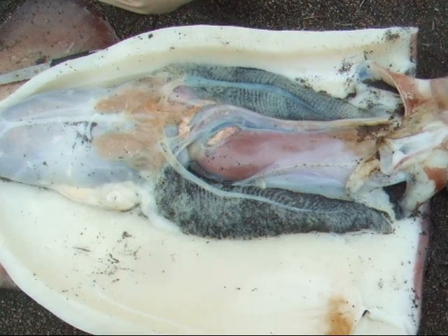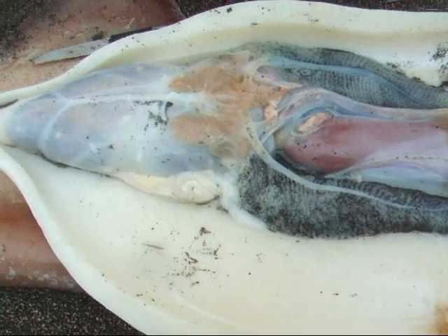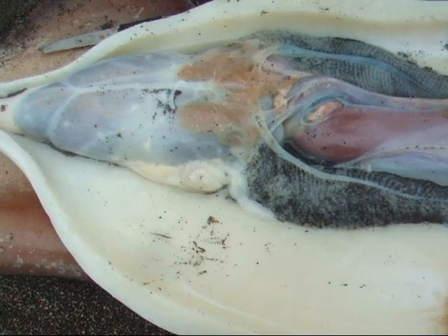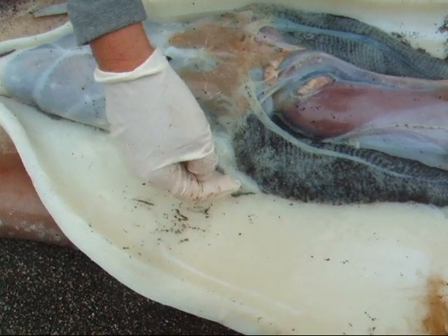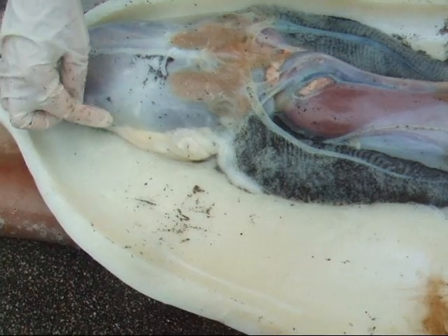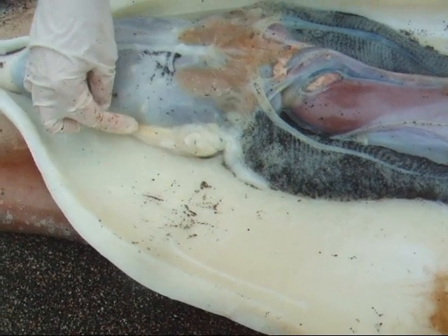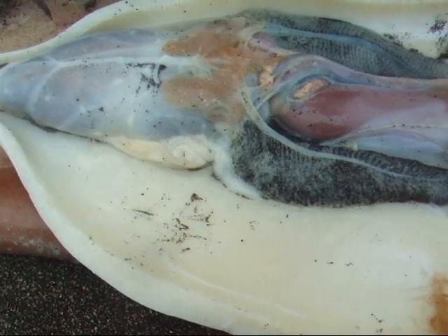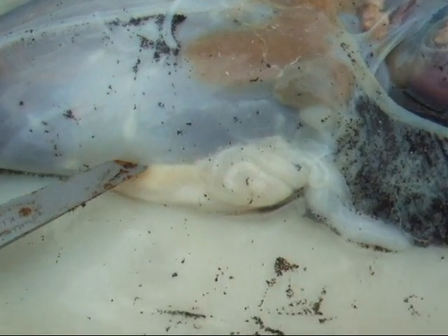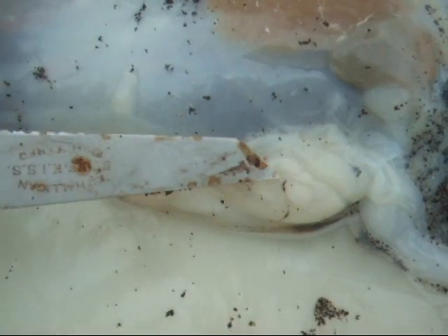Let's look at the reproduction organs. This specimen is a male. We know this because of this structure right here and this structure right here. This is actually where the sperm is made. You can see inside this grooved area, which is the seminal vesicle, and the ductus deferens, which is coiled up.